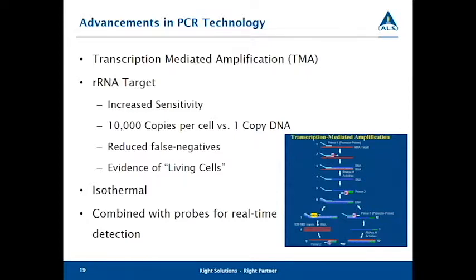Hey, Roy, this is Kelly. We have a question that came in regarding that from Joe. I'm going to read you his question. Sure. He says that I understand how PCR works. The DNA gets denatured and becomes 2 ssDNA. The forward primer attaches itself to one strand and the reverse primer attaches itself to another. My question is, how does the primer know when to stop synthesizing?